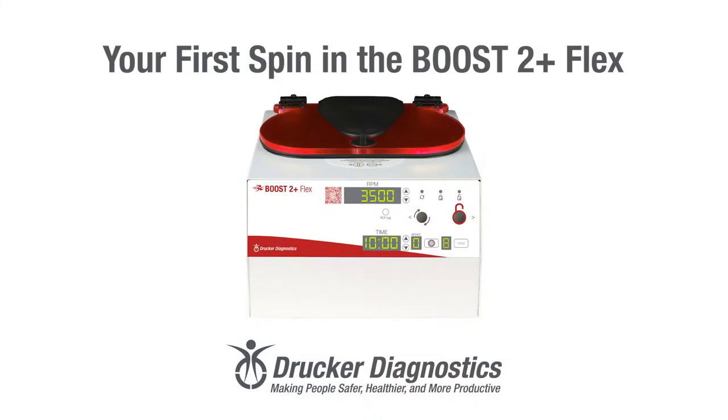Hi, I'm Dawn with Drucker Diagnostics, and today we're going to do our first spin in the Boost 2 Plus Flex centrifuge. Your Boost 2 Plus Flex is set up, and now we're ready for our first spin.